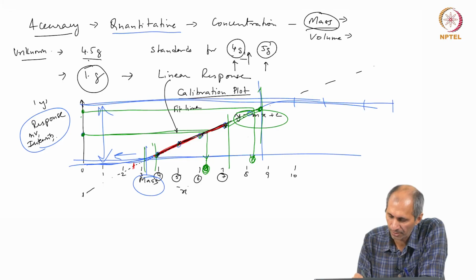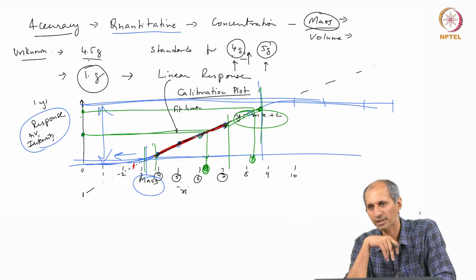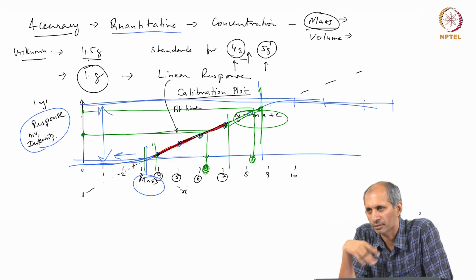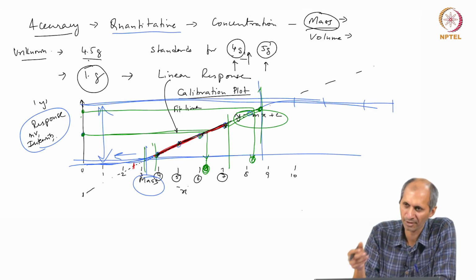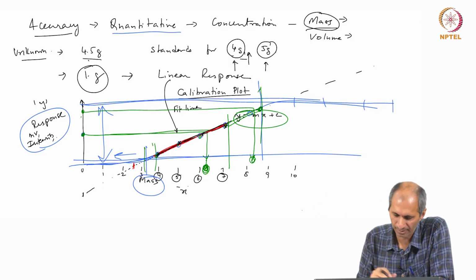It is not. So, when we are doing this, you have to report it, you have to say that it is outside my calibration range. So, you can extrapolate it, but it could be wrong. Okay. When you report a value, you have to do that because that has repercussions. If you yourself realize that it is beyond your calibration, you have to make amends for that.